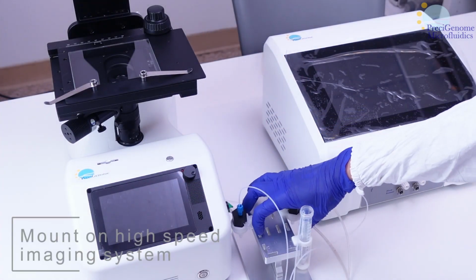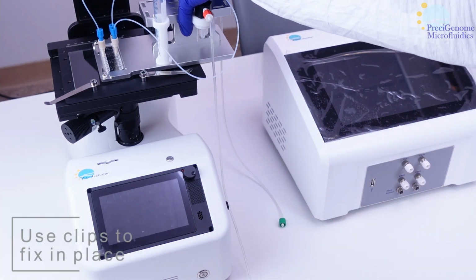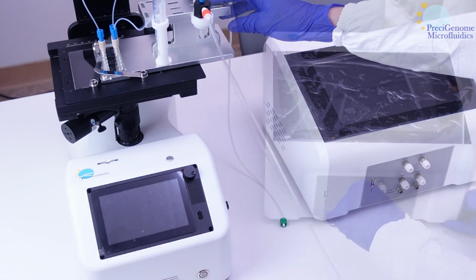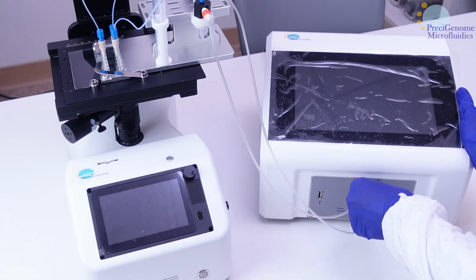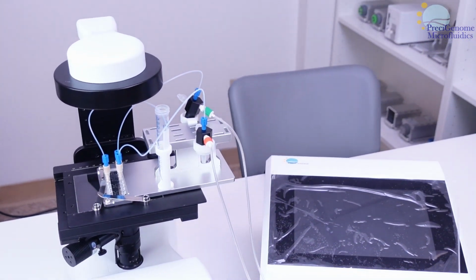Whichever setup you end up using, mount it on the high-speed imaging system. Fix it in place with the microscope's clips. Connect the Tygon tubing to the pressure controller, and your setup is complete. For how to monitor droplet generation, please see its respective video.